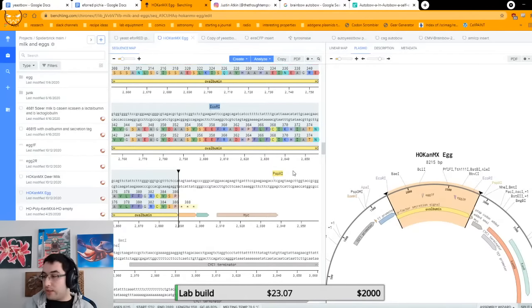Yeah, people correctly pointed out this is called a his tag. I don't know if I'm going to use a his tag. I might use a different tag. We'll see. But hopefully, depending on how long this stream goes, because I am getting hungry, so I don't know how long I'll go for, one of the things that I need to do is add a his tag to this.